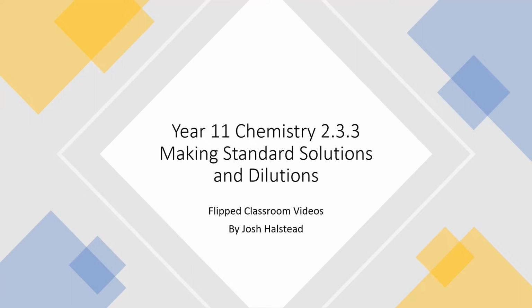G'day chemistry students. In this video, I'm going to be demonstrating how to make a standard solution and also perform a dilution. Now, the purpose of this video is to show you some new glassware that we haven't used before. It's specifically made to measure volumes of specific quantities at really high precision.